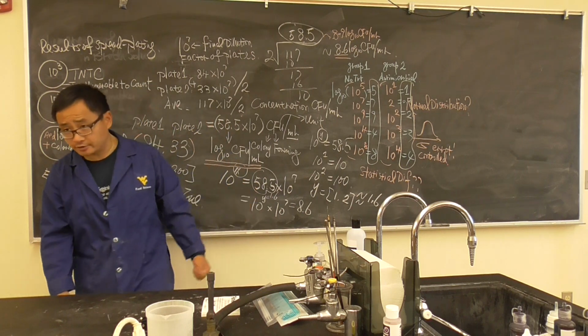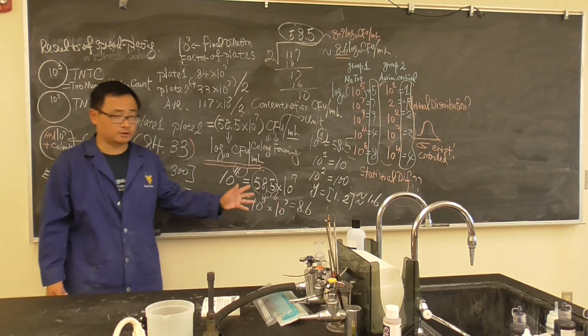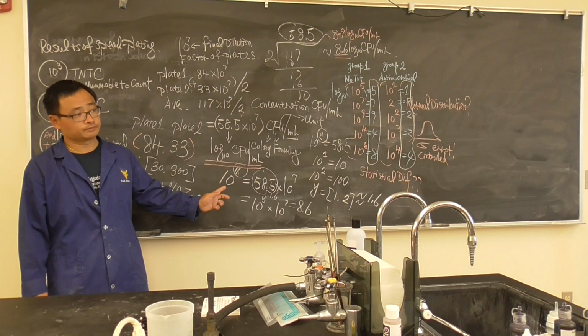Now, you can use a calculator. I've been doing this too much in my life, the last 15 years, so I know approximately how much. You can just use a calculator to calculate. Okay, so that's the story. You have to change to the log.